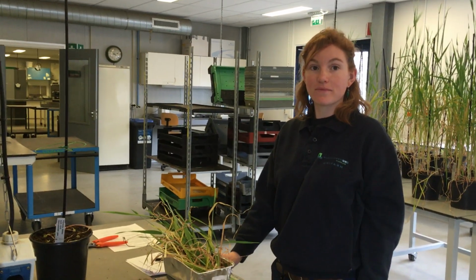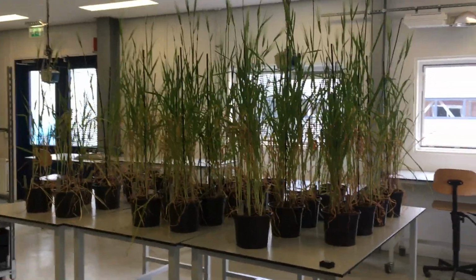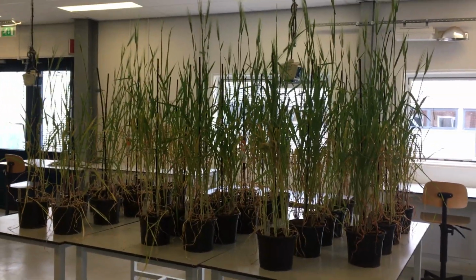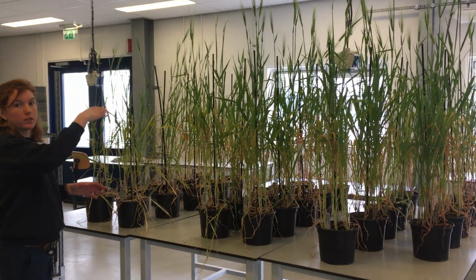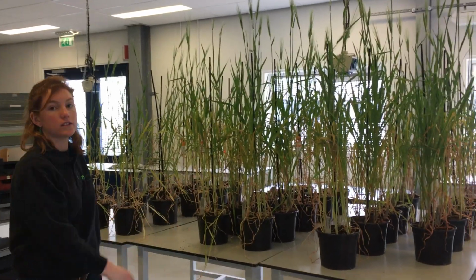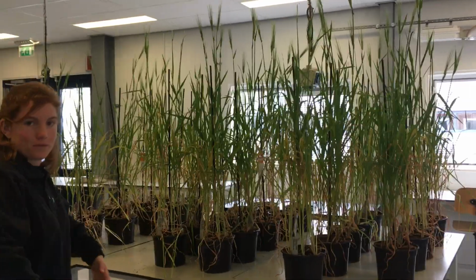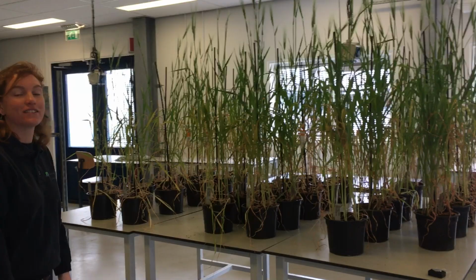Thank you, Pauline. And in such a way, then we will do the rich soil and also the medium soil and the poor soil. You can already see the difference. Pauline, could you show the poor soil? You see the plant looks smaller. They're lower and they don't have as many leaves. They're a lot less dense. Then medium and rich, not so much difference, but rich soil plants look higher, and stronger, thicker, greener too.